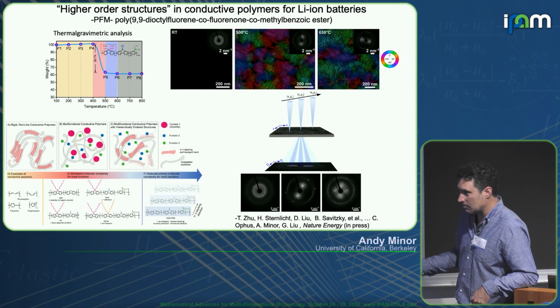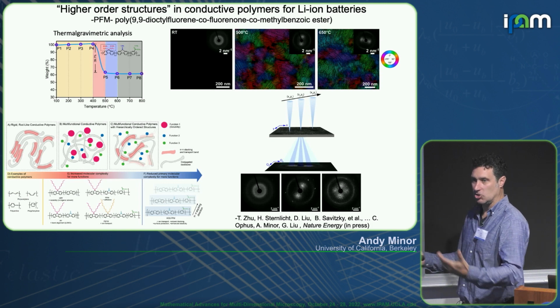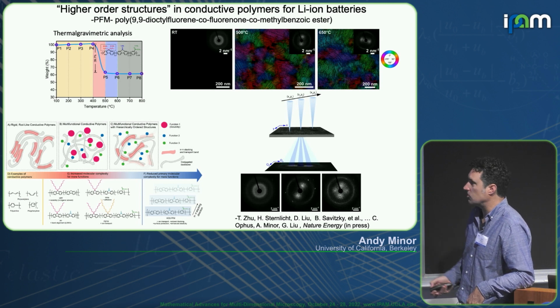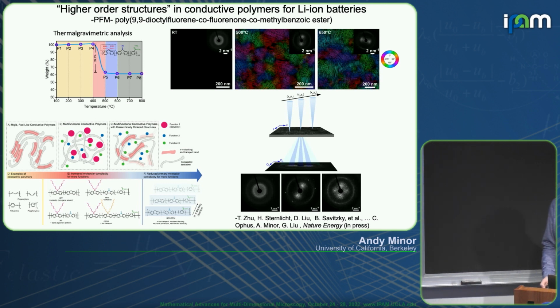It looks a lot just like that amorphous scattering, right? So it's really the spatial resolution of 4D STEM, being able to take individual crystals, that actually shows you the microstructure. The X-rays don't show it, I should have shown that plot here. The X-rays really don't show anything like this. And so that's the power of this 4D STEM technique.